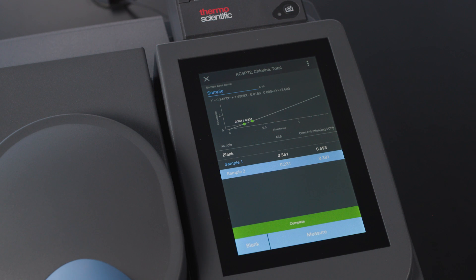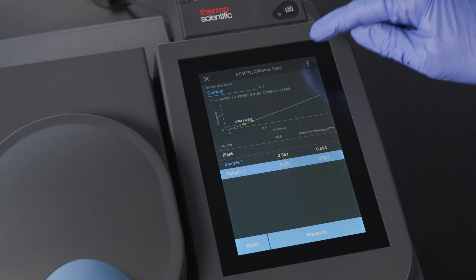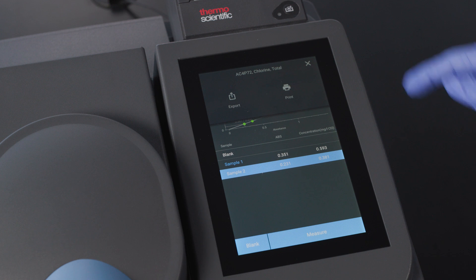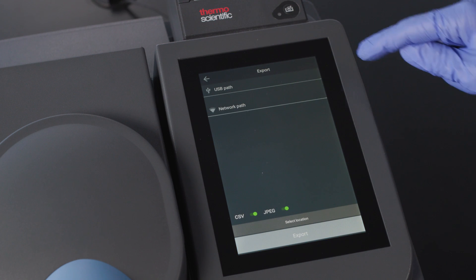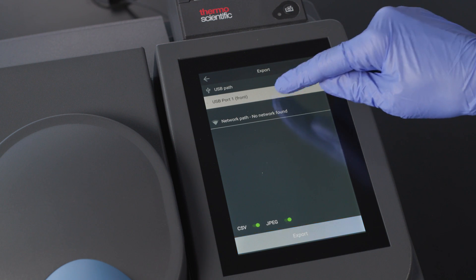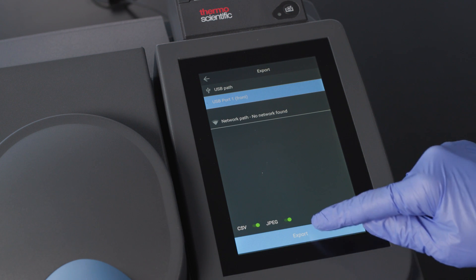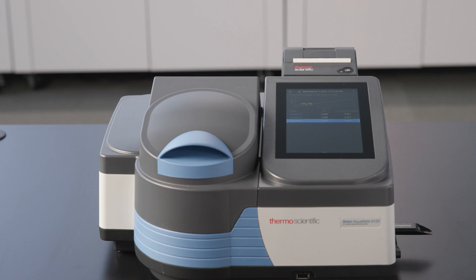The process is fast and easy. Once we are done with our experiments, the instrument automatically saves the results. We can also export them using USB memory media, or by a direct network connection, or by printing them using the integrated printer.